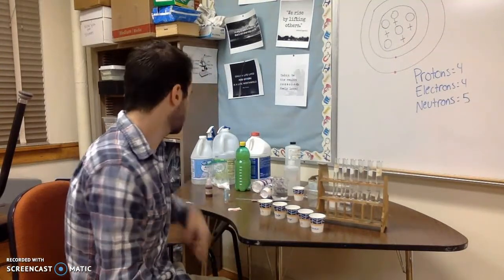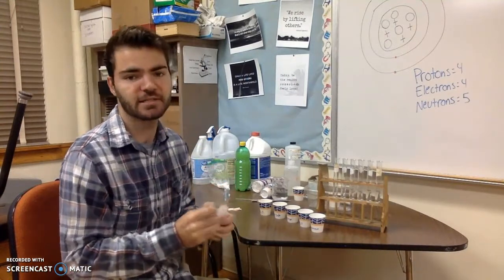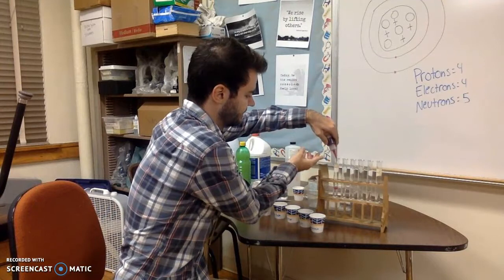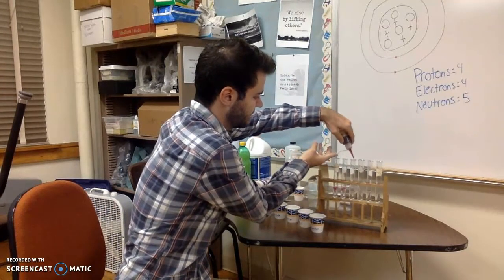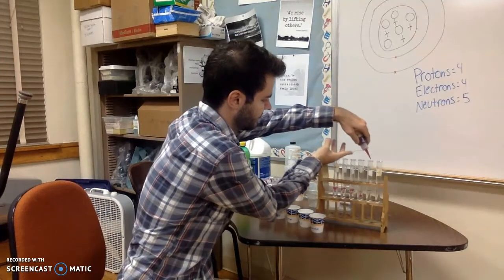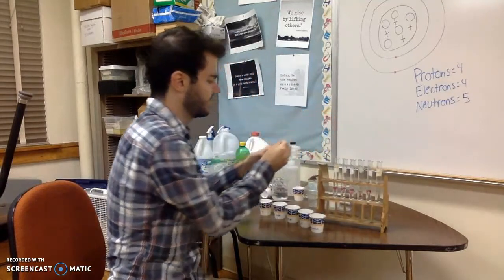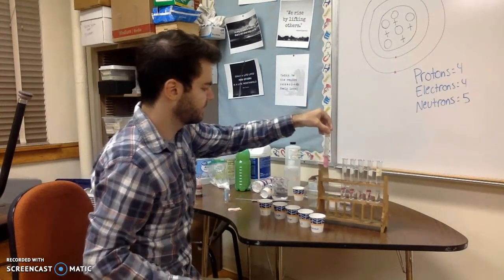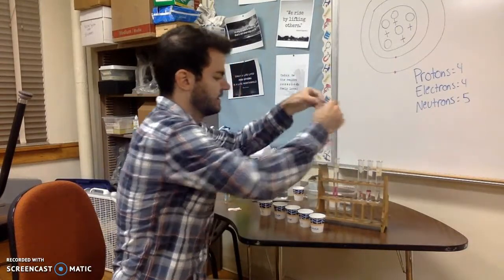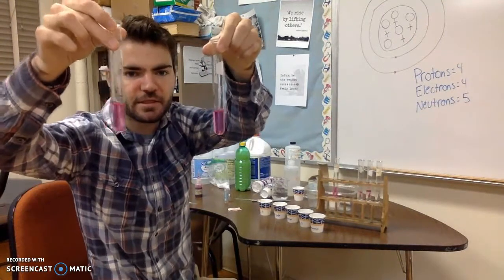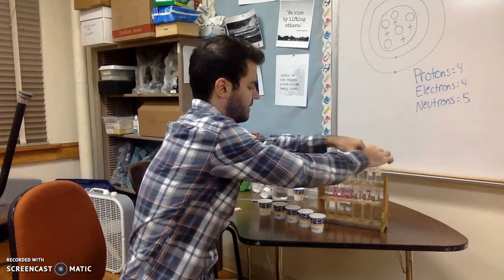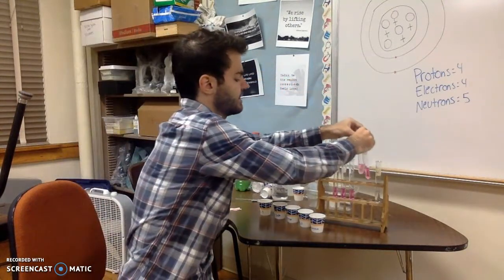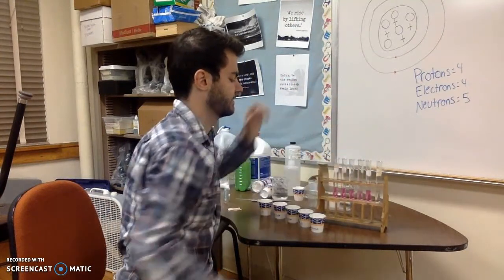Then the second test that we'll do is a phenol red test. So this is a liquid. And as you can see, I'm going to put a few drops into each test tube. Get it nice and pink. I don't know why I have six test tubes. I'm only going to need five. So what I'm going to go ahead and do, I'm going to mix these up. Make sure they get pink. Obviously, they are turning pink. We're in business. And what's going to happen with phenol red? If there is an acid put into these, it's going to go from pink to yellow.